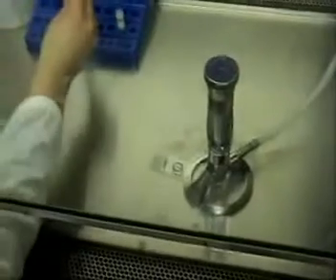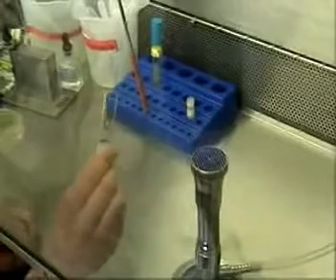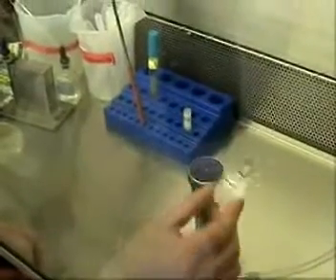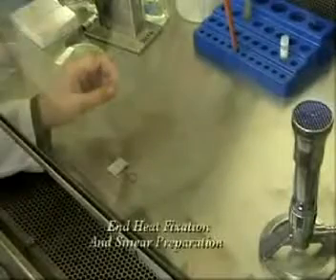Now allow the smear to air dry completely before heat fixation. For heat fixation, pass the slide across the Bunsen burner two to three times and test to see if it's warm to the touch but not burning.